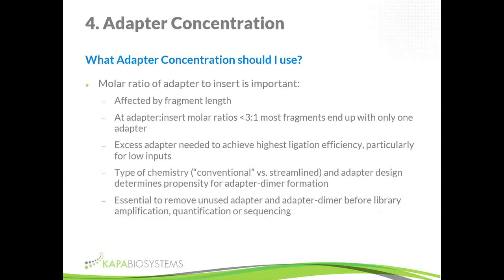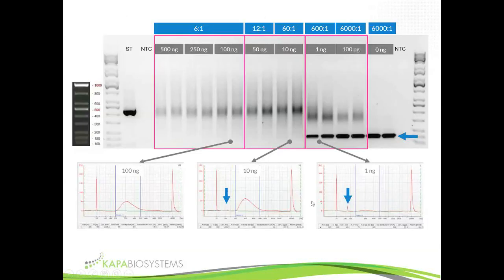And so this is a really interesting experiment that we kind of did by accident one day, and I wanted to show you just the trends. So this was done with a conventional protocol. This is not the HyperPrep or the HyperPlus protocol. So it's still the three-step protocol, but it's a little irrelevant in the context of the larger discussion.